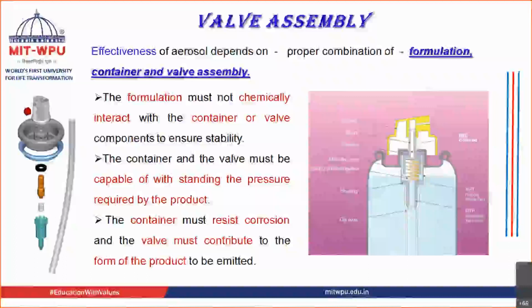We are going to see about the valve assembly. Starting from the actuator up to the housing, up to the dip tube, this whole assembly is nothing but the valve assembly. This valve assembly has different parts.